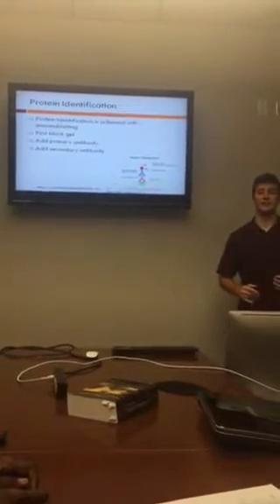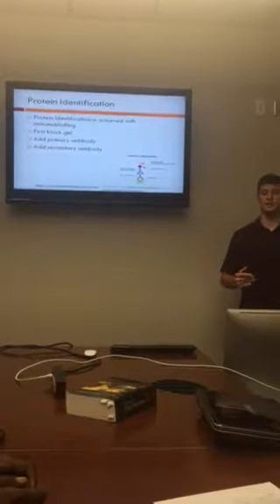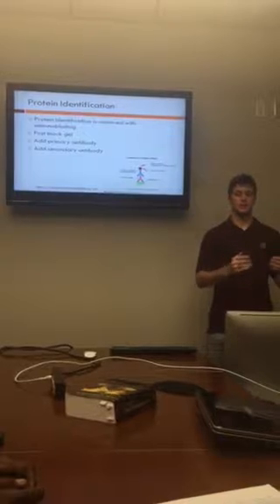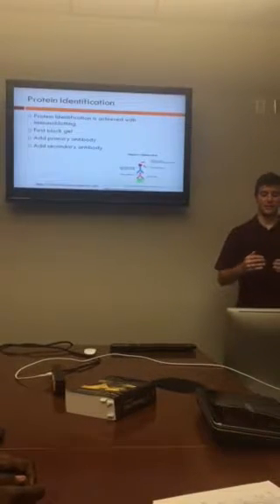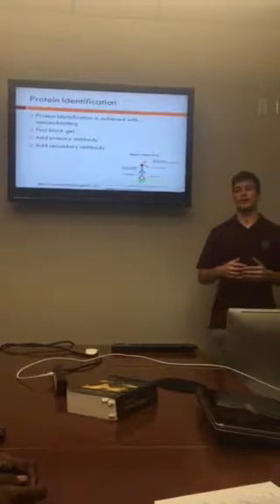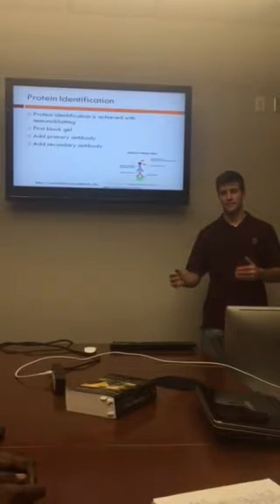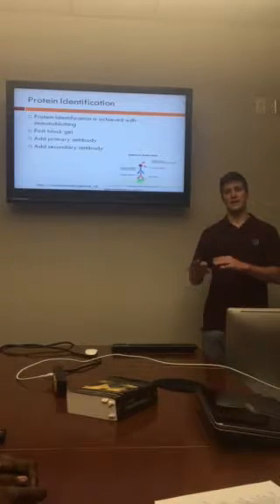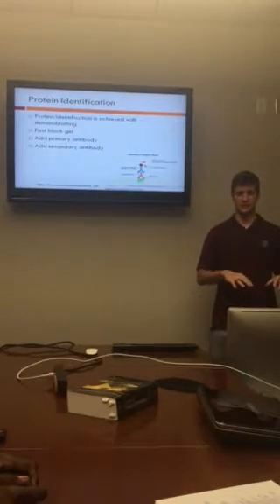So the last step in the Western blot is protein identification. Now we've transferred protein to our membrane, and we're going to first do a blocking method where we add some protein, generally BSA, that interacts with the protein in the membrane. That's to diminish non-specific interactions.